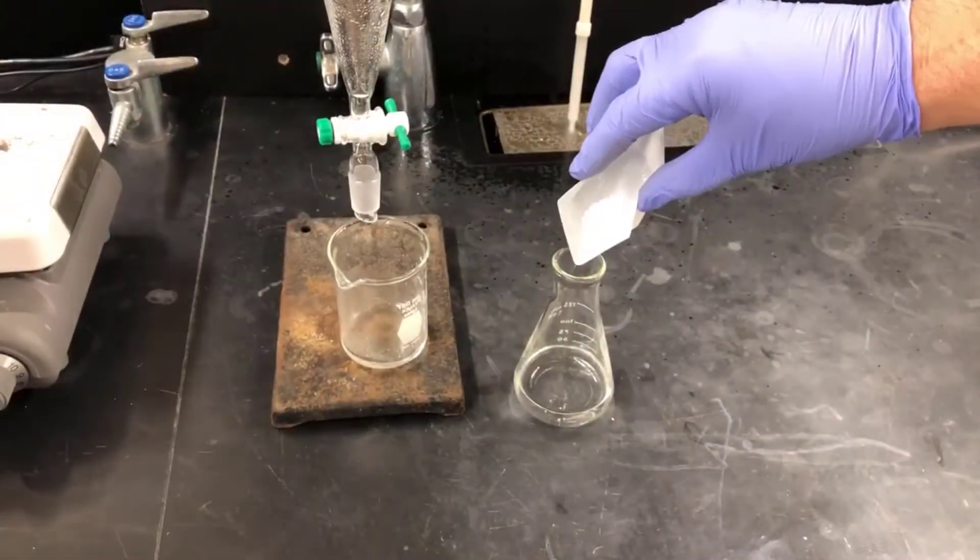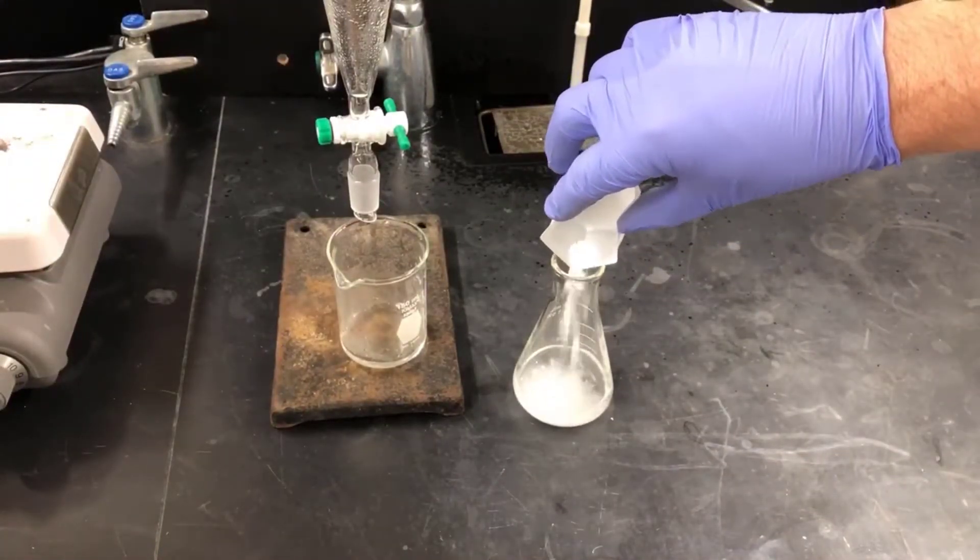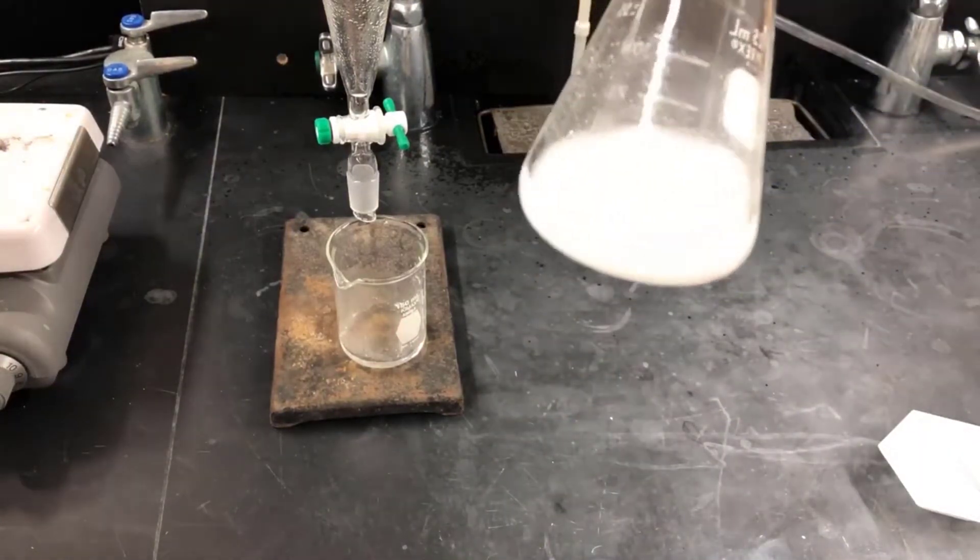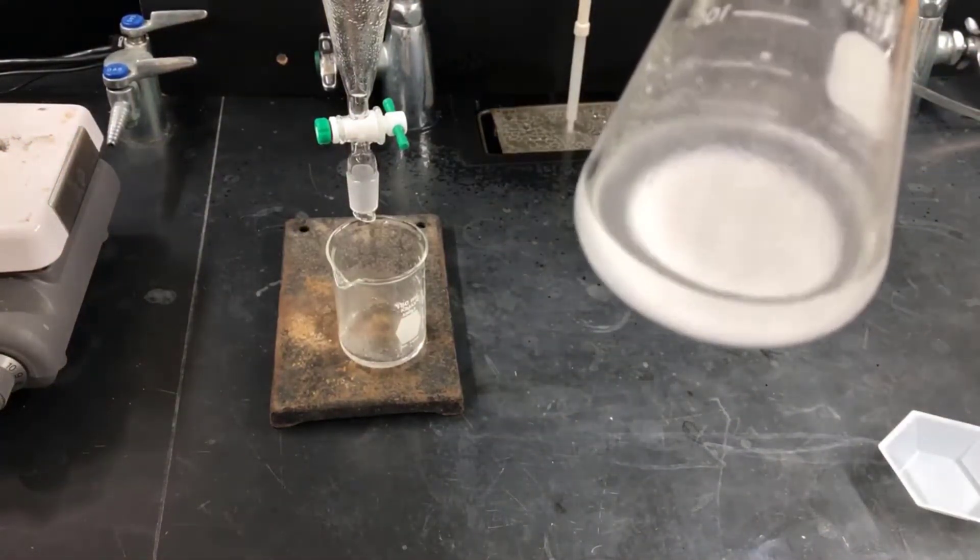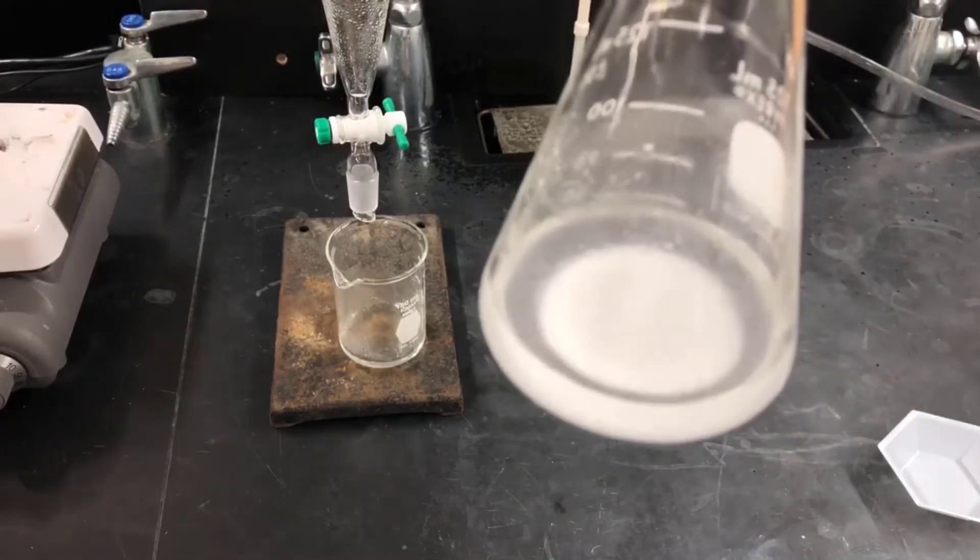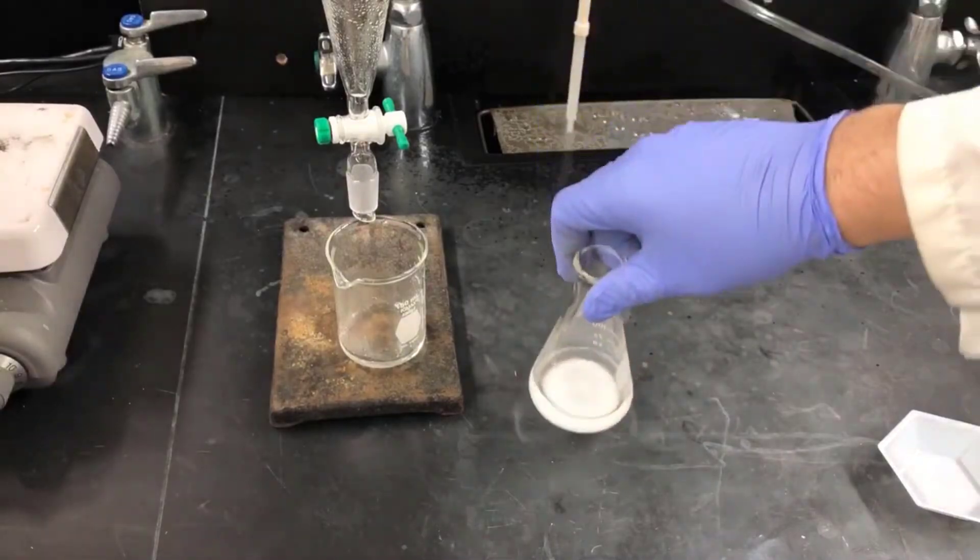Now I'm adding the magnesium sulfate to the ethyl acetate solution with caffeine, and I'm giving it a swirl. You'll know you've added enough magnesium sulfate if some of it remains free-flowing when you swirl it. Magnesium sulfate should get swirled up when you agitate it, but then settle out. If it's all clumpy, you need to add some more magnesium sulfate.